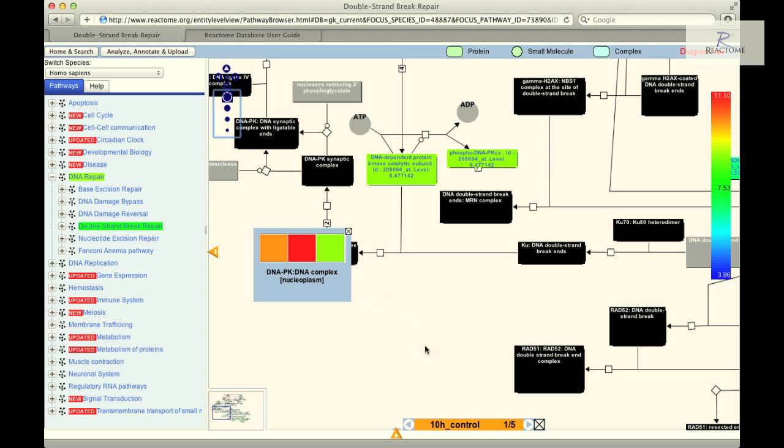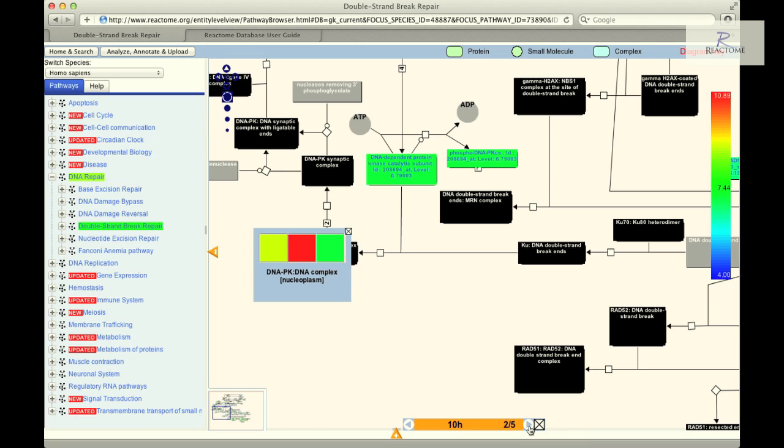At the base of the diagram you will see a bar containing the text Experiment 10Error_Control and two arrows. Click on the forward arrow four times. Some of the entities will change color in the pathway diagram, reflecting changes in their expression over the different time points.